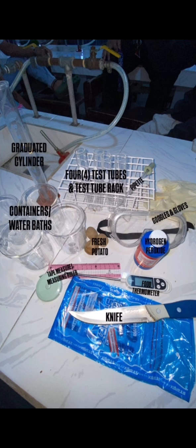Measuring ruler to measure the foam height. Knife and cutting board to cut equal potato pieces. Safety goggles and gloves for laboratory safety.